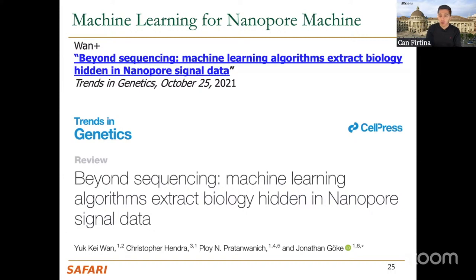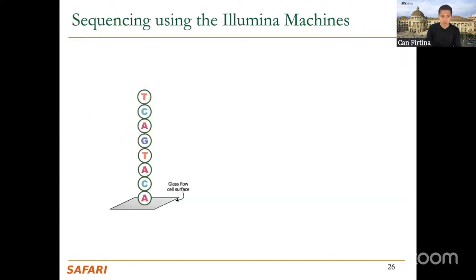Also, as I said, Nanopore raw signal data retains richer information than just individual bases. If you're interested in what we can do with this type of information, you can take a look at this paper. So now we're done with Nanopore sequencing.